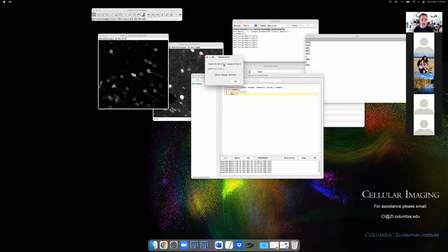So I know normally when we do scripting and teach people all the way through, we can spend a day or more. So this is a bit of a crash course, but hopefully you can keep up as we do the very simple macros and work towards a more complex analysis script.